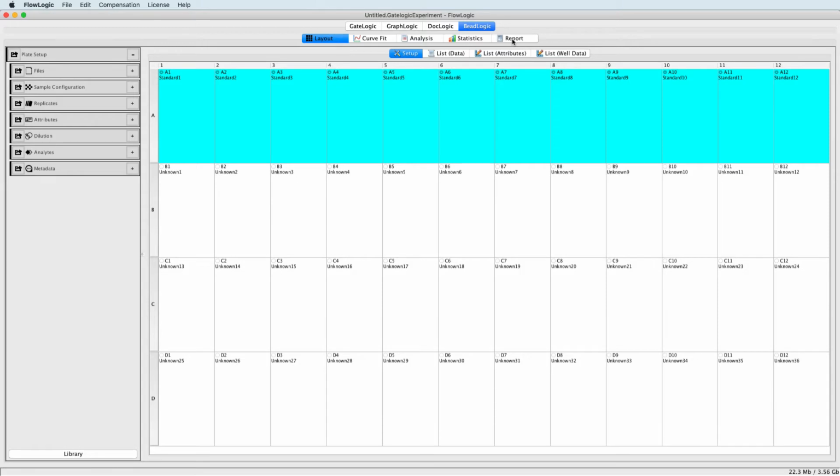As the initial setup was performed in BeadLogic, most of the options in the plate setup windows on the left-hand side of the screen will be unnecessary. However, they can still be used to edit various elements of your analysis.